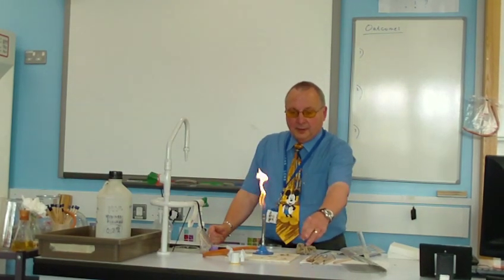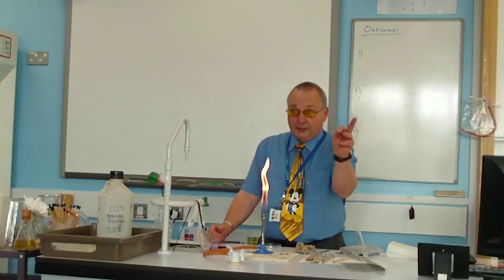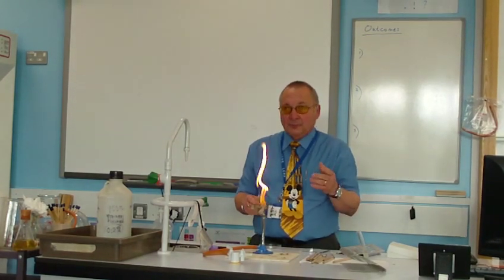So, goggles. I'll put the piece of magnesium here. Don't drop them when you carry them. If you do drop it, just let me know, because obviously we don't want chemicals about.